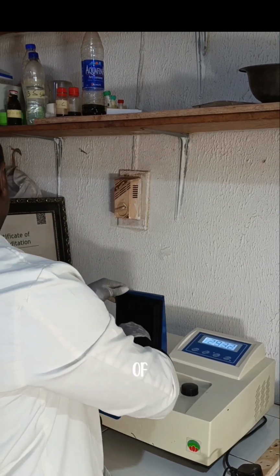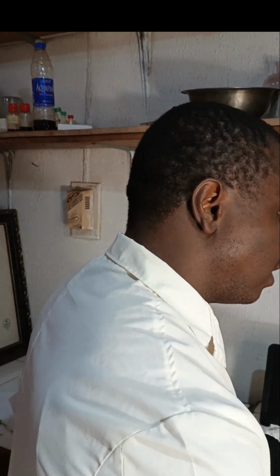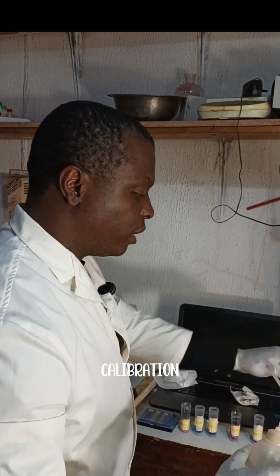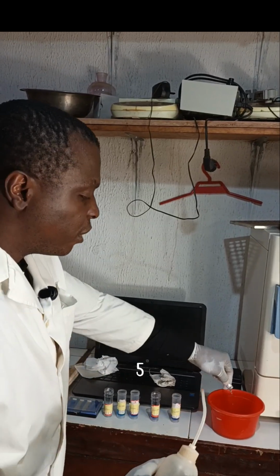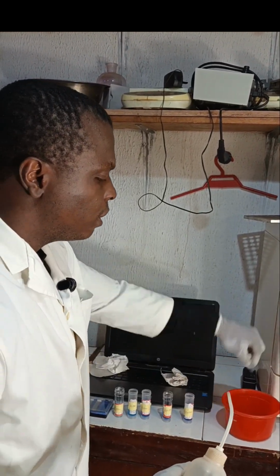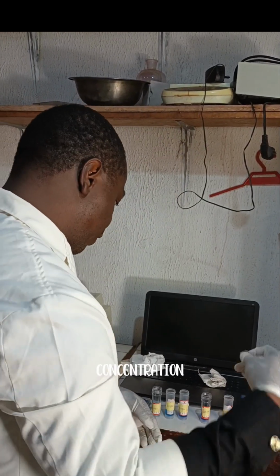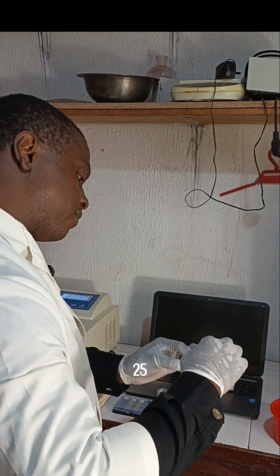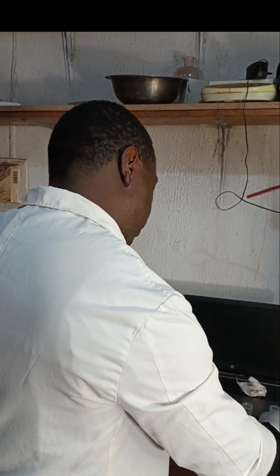Now we take the last of the readings. At least anytime you are performing calibration, it is important that we use at least 5 different standards that will be increasing in concentration. So we take the last, which is 25 parts per million.